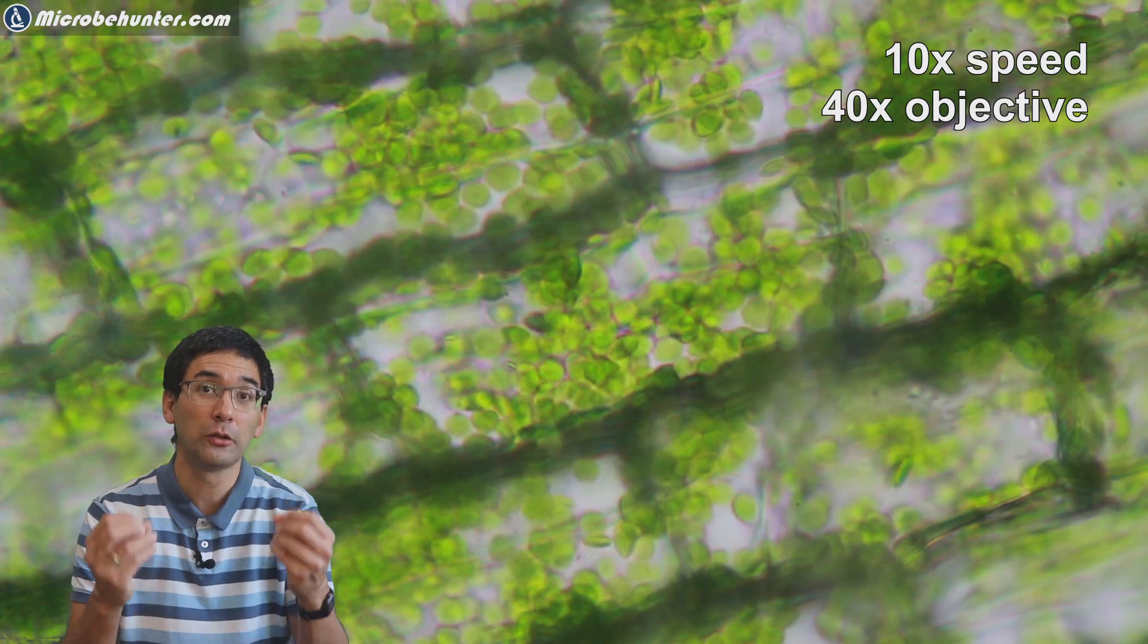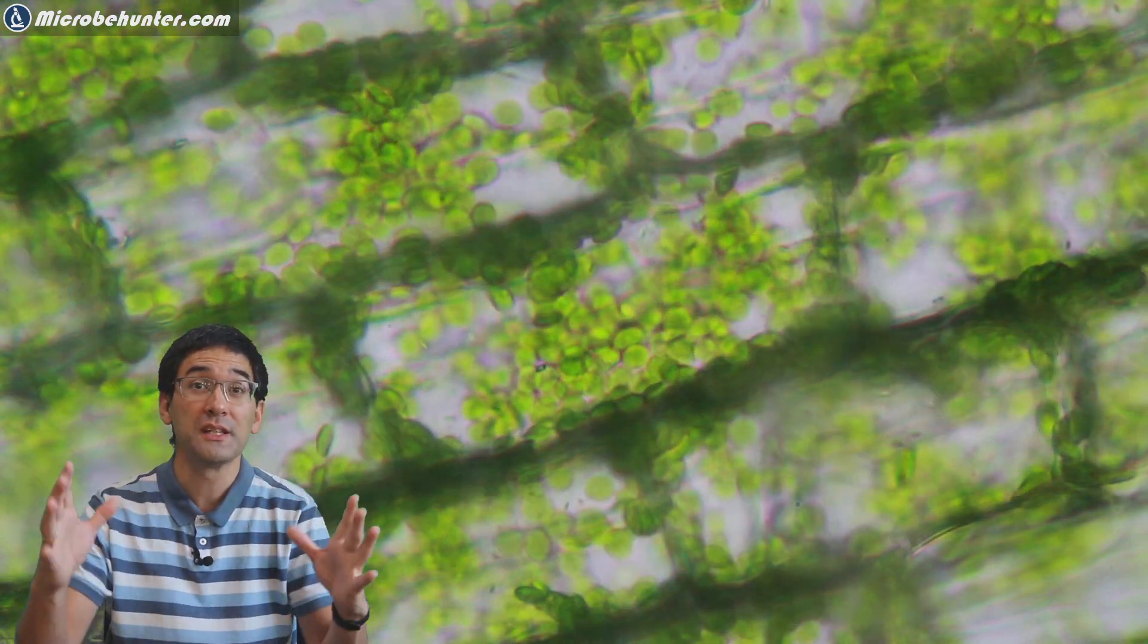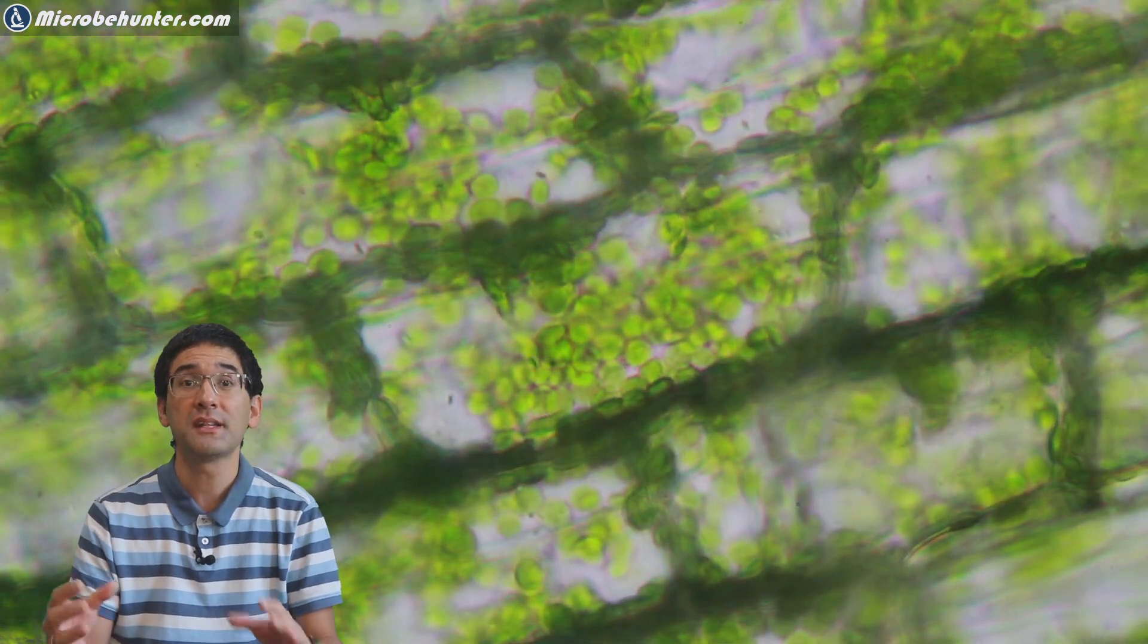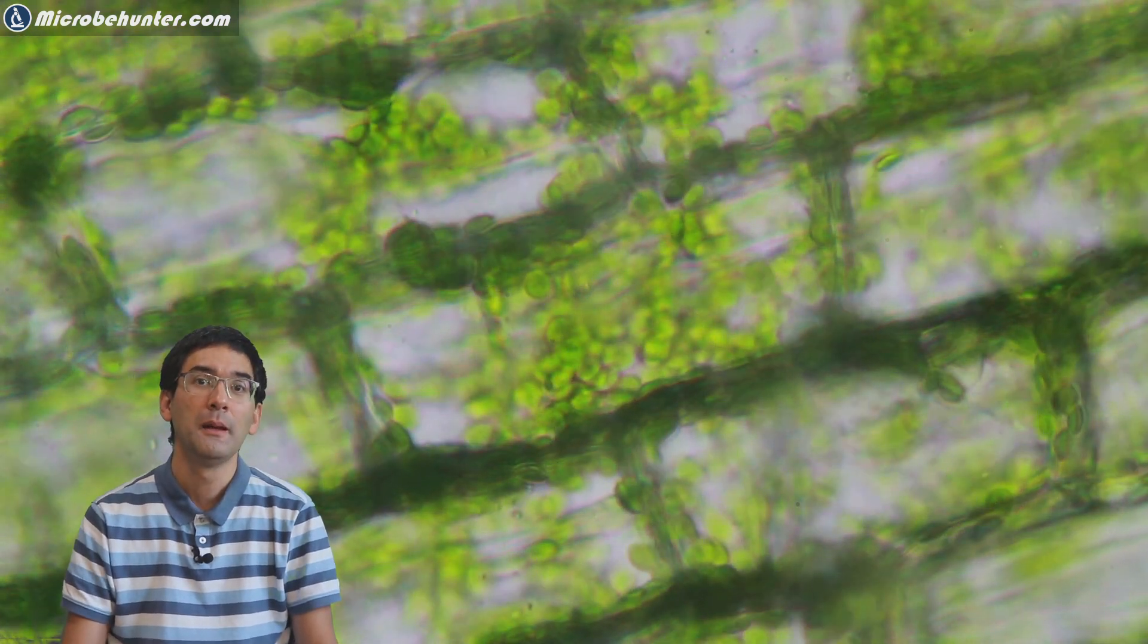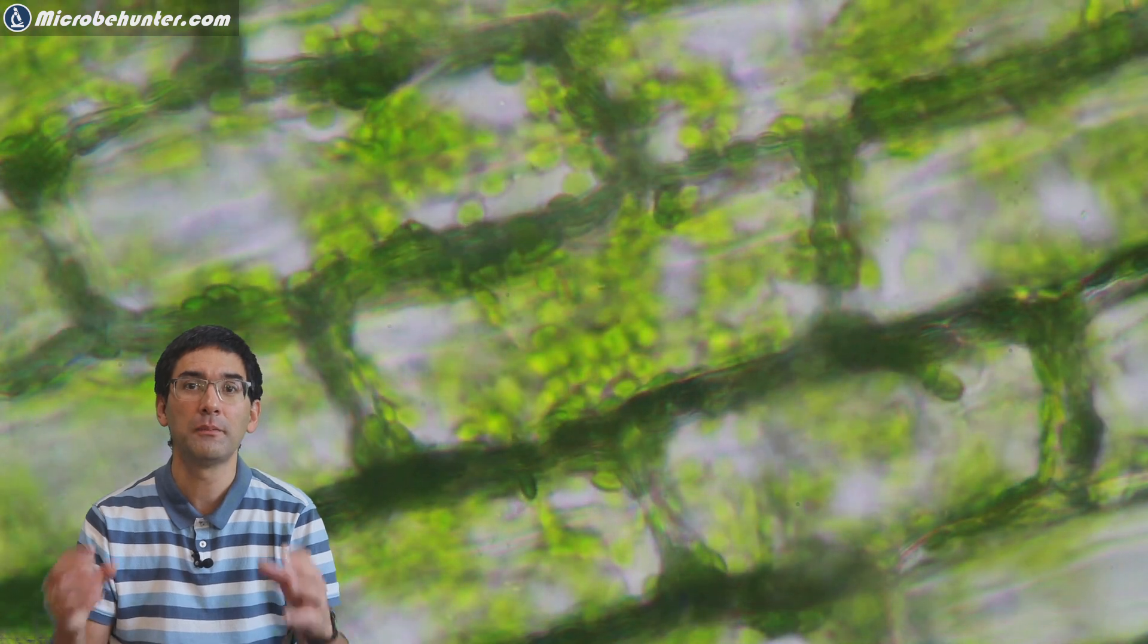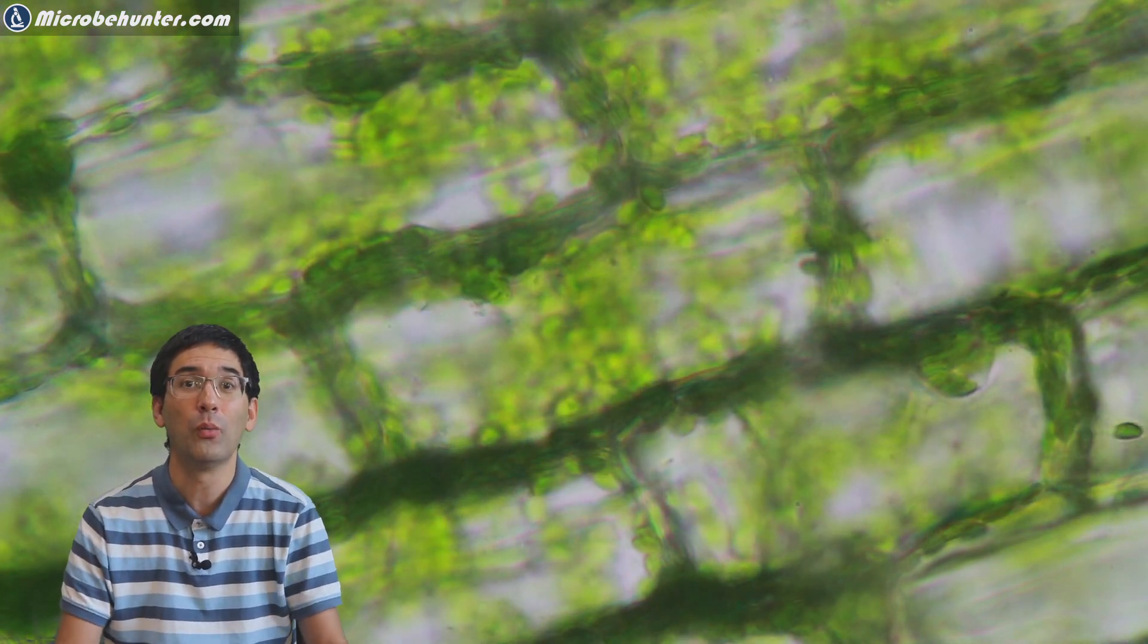When you look into the cells, then you can also see that the chloroplasts are the only structures that are actually really pigmented. You can also see the cell wall, of course, but other cell organelles like the nucleus and mitochondria, they are quite transparent and therefore difficult to see. But the chloroplasts themselves, they move around in the cell. And the question is now, why do they do that? And what makes them move?